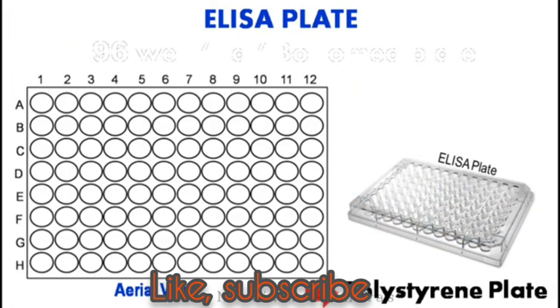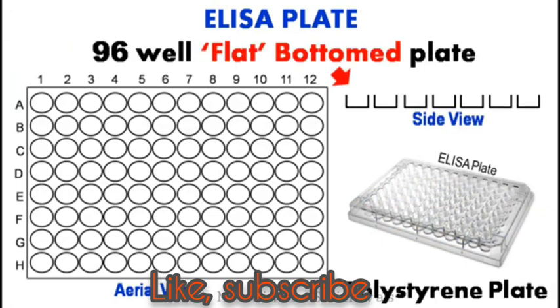This protocol is done in an ELISA plate, which is made up of polystyrene material and consists of a 96-well, flat-bottom plate. The test can be done in each well separately for each sample. So this test helps in large-scale screening of multiple samples at a time, along with positive and negative control.